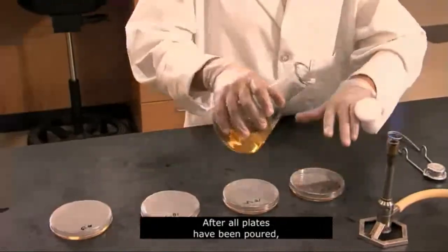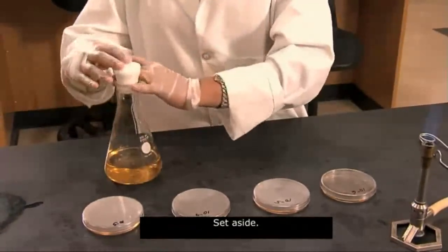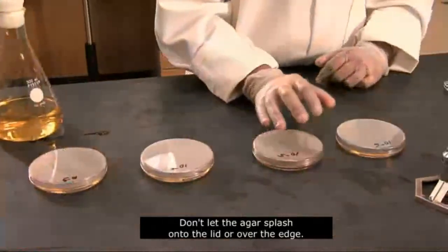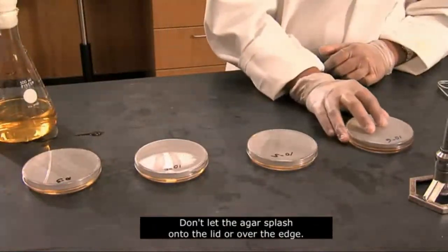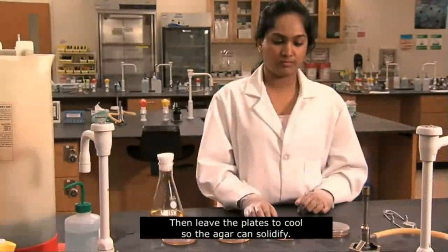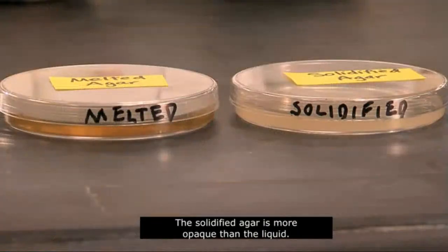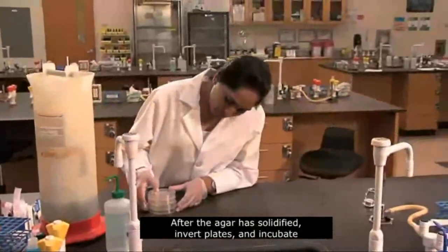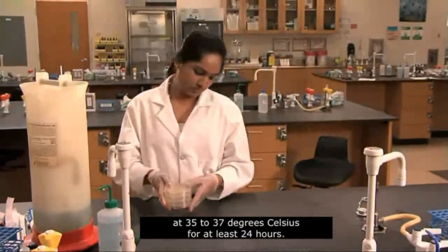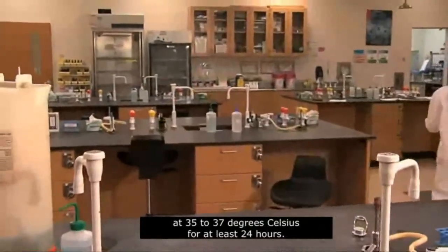After all plates have been poured, flame and re-plug the flask. Set aside. Gently swirl the poured plates for about 30 seconds. Don't let the agar splash onto the lid or over the edge. Then, leave the plates to cool so the agar can solidify. The solidified agar is more opaque than the liquid. After the agar has solidified, invert plates and incubate at 35 to 37 degrees Celsius for at least 24 hours.